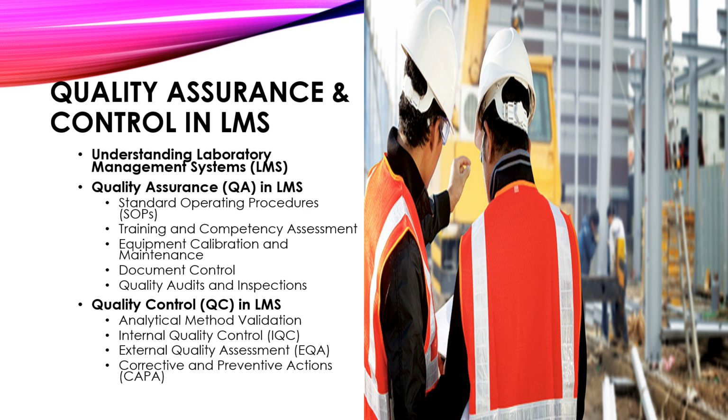Quality audits and inspections: periodic internal and external audits to evaluate compliance with quality standards, identify areas of non-compliance, and implement corrective actions is key. Audits provide valuable feedback for process improvement and risk mitigation.